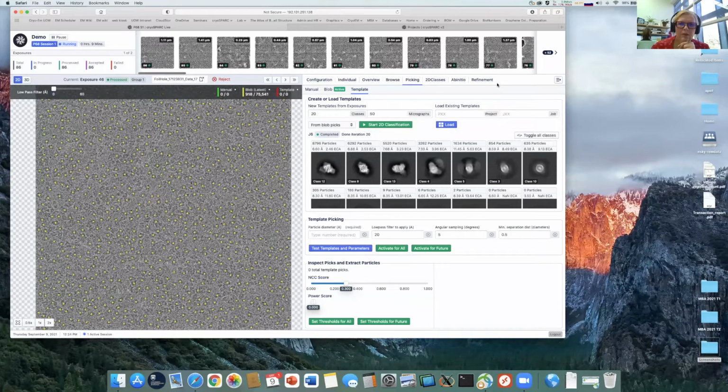It links all those together in a format. So it's basically like cryoSPARC can do all the same things, but you would have to set up each job manually. So what we've done so far in here, we've probably done at least 5 or 6 different jobs. And you would have had to start a job, wait for it to finish, start the next job, wait for it to finish, iteratively, while cryoSPARC Live is this kind of GUI wrapper on top of that, which makes it all happen. Wow.